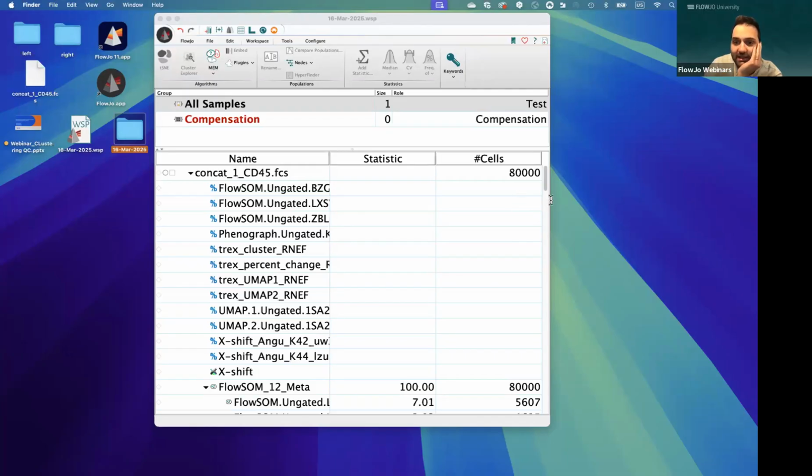Gabriela is asking, hi, Ioannis, T-Rex can only compare two conditions with each other, even if we set up the experiment with 2 time points and 2 conditions per time point. Yes, that's true, only 2 conditions. That was my question in the beginning too, if we can have more to check all the different conditions and time points, but it takes one at a time.